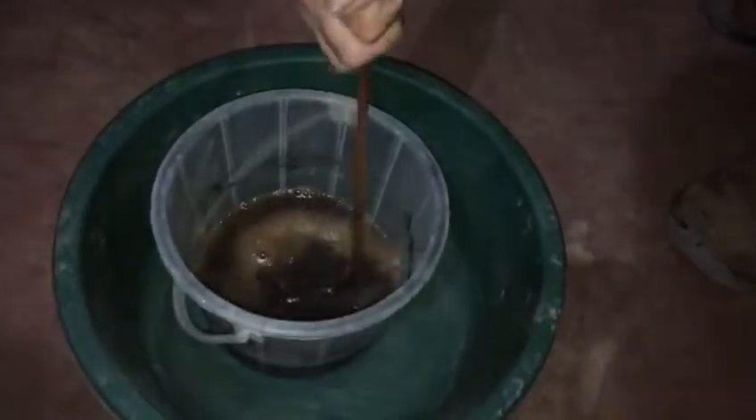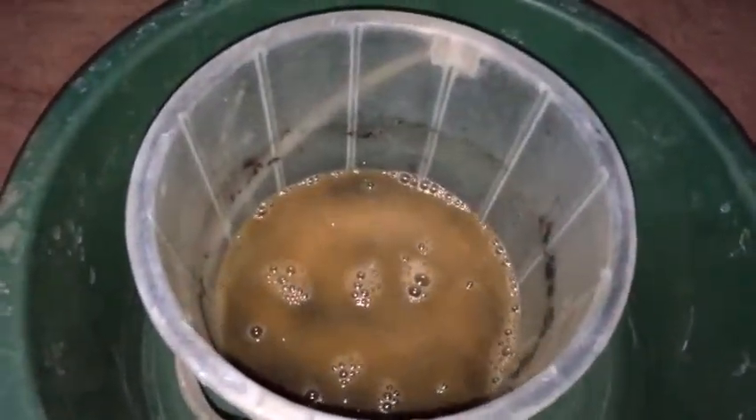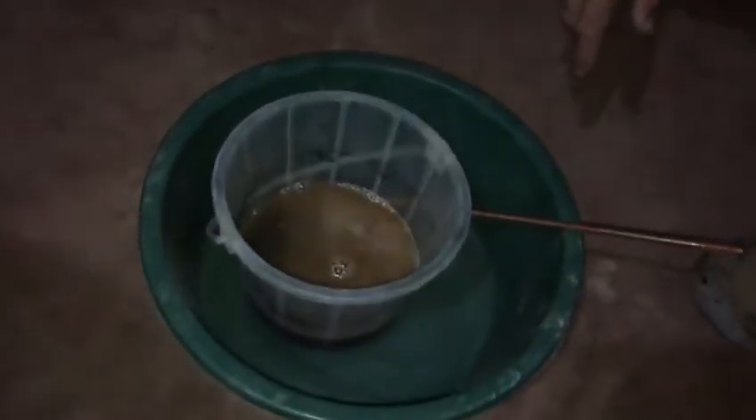We're mixing our number two concentrates — lots of pyrites and iron and things — with some hydrogen peroxide to help break down the sulfides. As you can see, the peroxide is reacting pretty vigorously with the material. This will help break down the sulfides and hopefully release some of the gold that's locked up in there.